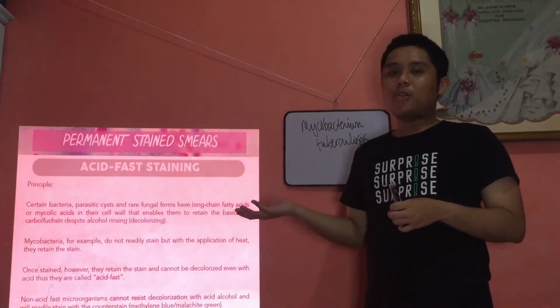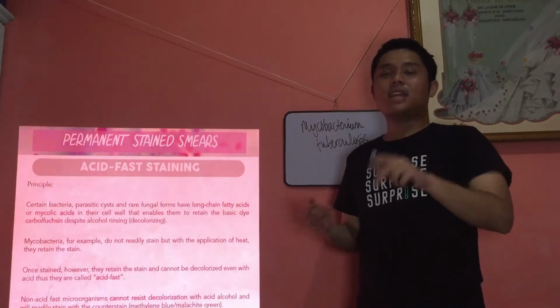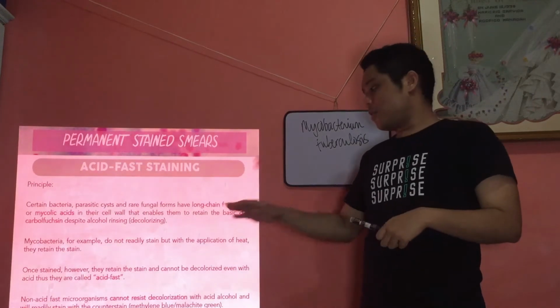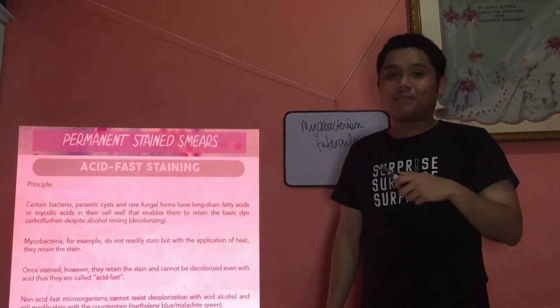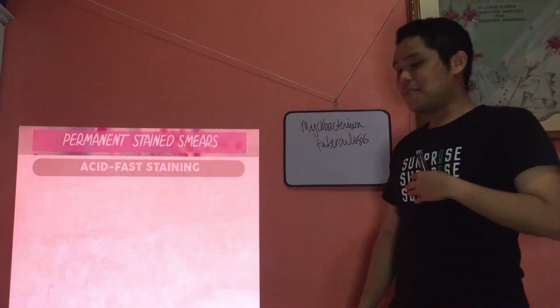If you use methylene blue, which is the normal stain that we use as the secondary stain, the non-acid fast organisms and the background debris will appear blue. And for malachite green, as the name says, the non-acid fast organisms and the background will appear green. Alright.